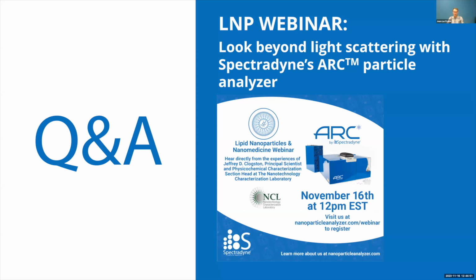One of the questions from Dario was, how is the flow rate measured in the ARC, and what's the total volume of sample analyzed? When we talked about the electrical signal generated from each particle, one of the things we measure is how big the particle is. And the other thing is how fast it goes through the constriction. So the transit time of the particle is what tells us the volume flow rate through the constriction. And that's how we measure it.